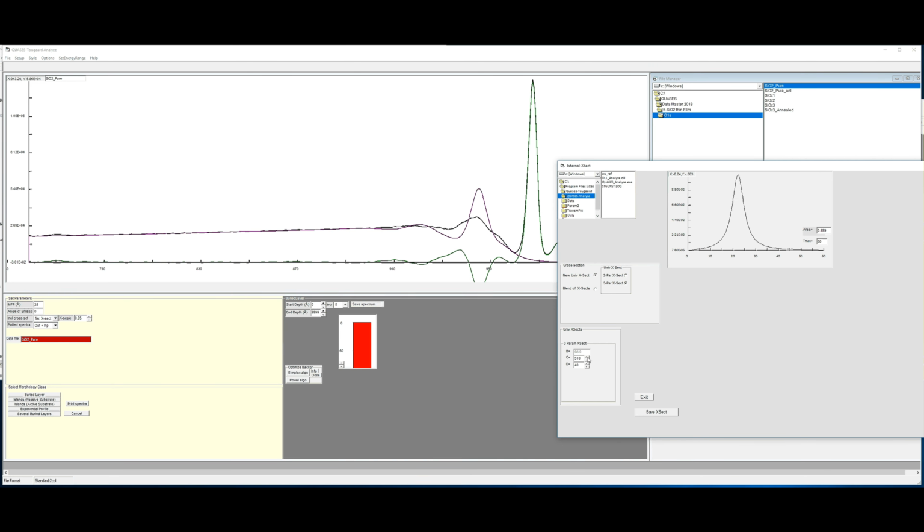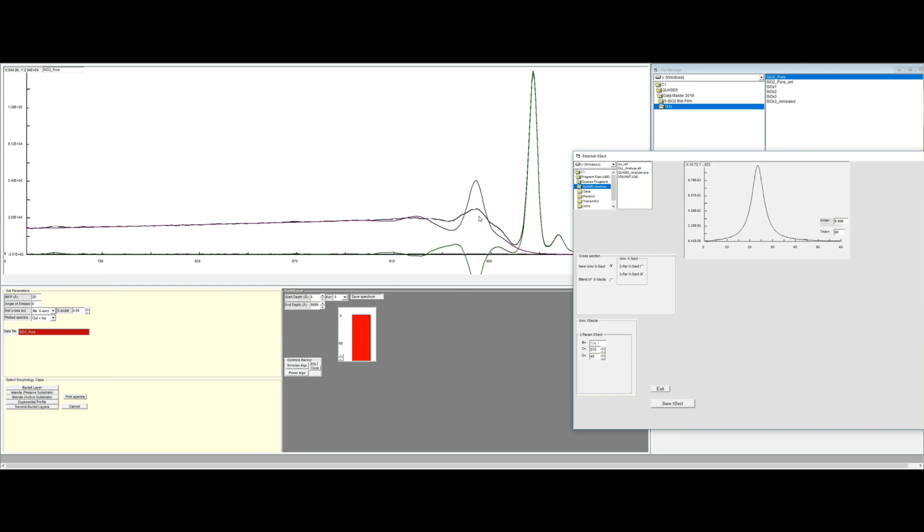So we start by putting this more or less over the structure we see here in the spectrum. We can also vary the width of that. We do that by the parameter D. So we increase that, the width of that increases. So we can maybe move that up to a couple of hundred here. And now the width is more or less correct. We can move the position a little bit further in. So we have a good account for the structure here. We get a smooth background corrected spectrum in this range.